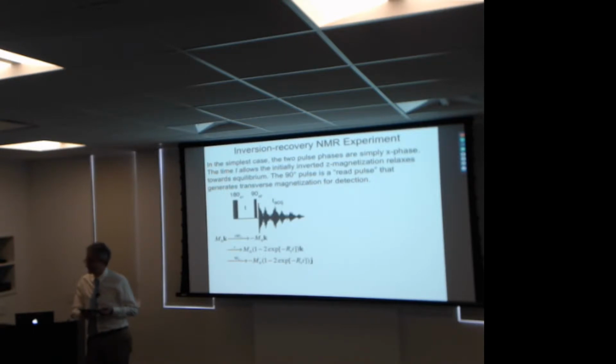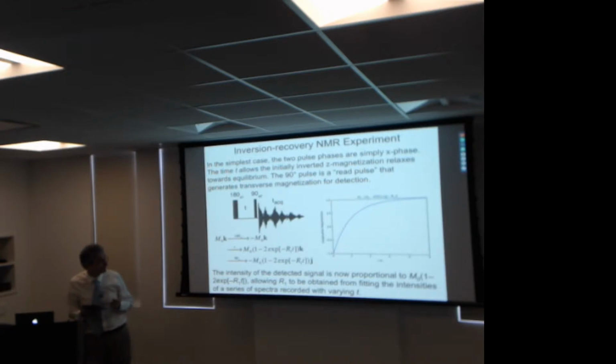Towards X. So when I do the arithmetic, I didn't even bother to do it, but the magnetization will rotate towards the plus X axis. So the part that stays on the minus Z axis will have the cosine omega t trig component, and the X axis will have the sine omega t.